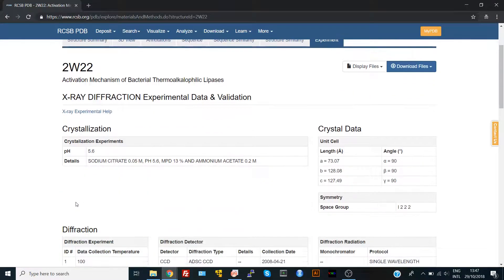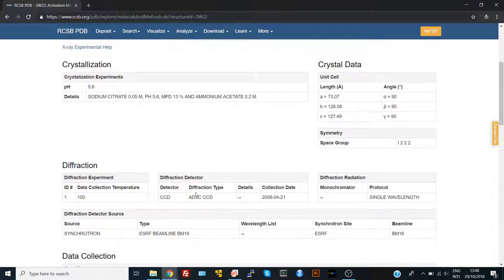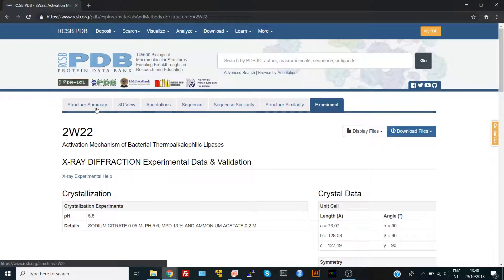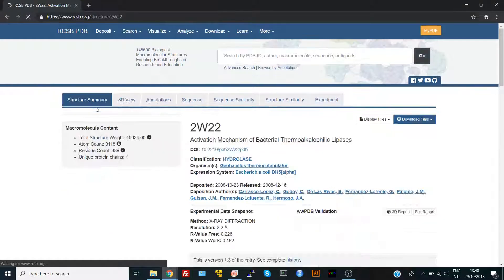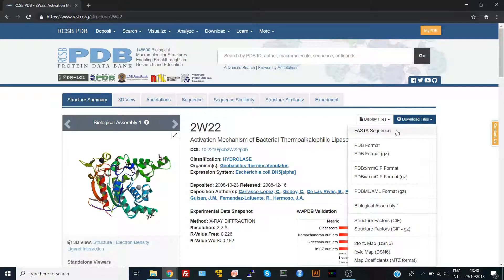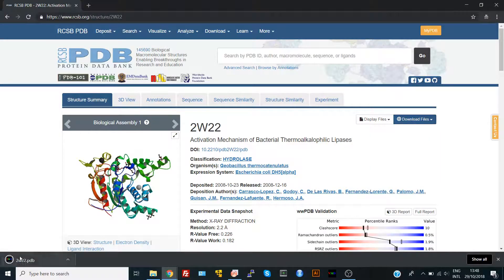You can find the conditions for experimental crystallization of this protein if you are interested in crystallization. But if you are interested in computational work and only want the PDB structure to run simulations or do calculations, you go back to the structure summary main page, click 'Download Files', select PDB format, and there we have our structure. Thank you.